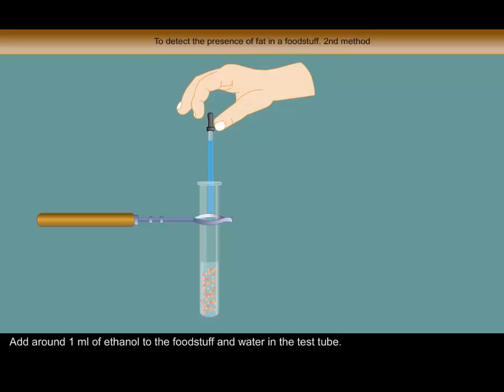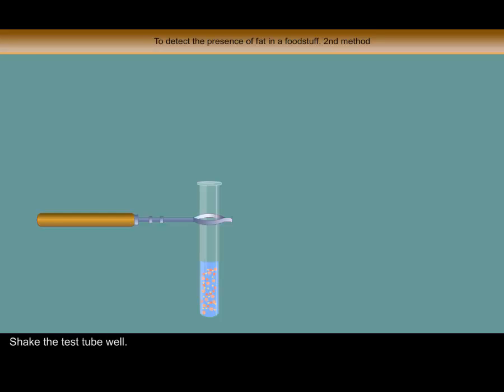Add around 1 ml of ethanol to the foodstuff and water in the test tube. Shake the test tube well.